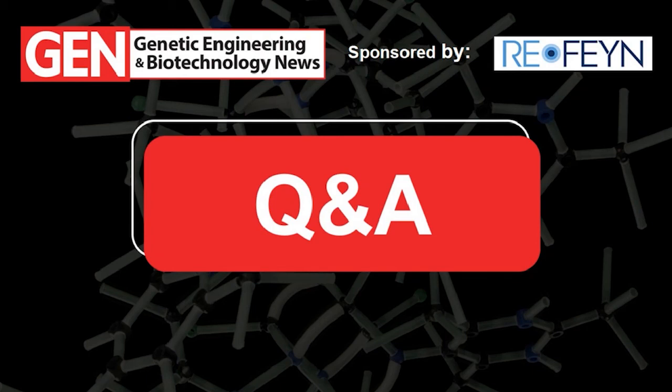Next question we have, an audience member says, besides empty-full ratio, is there a possibility of measuring concentration? Do you also see partial full, which I think you've obviously covered as well? Yeah, I think both are somewhat covered. With relative concentrations, yes, we are very precise. Absolute concentrations, as in virus titer, we cannot do at this point. And partials, you can see them. You can also use your own analysis pipeline to quantify them. They are just not yet, at this point, part of the quick and easy analysis pipeline. But we're currently investigating it, and hopefully we can launch that as a software update.